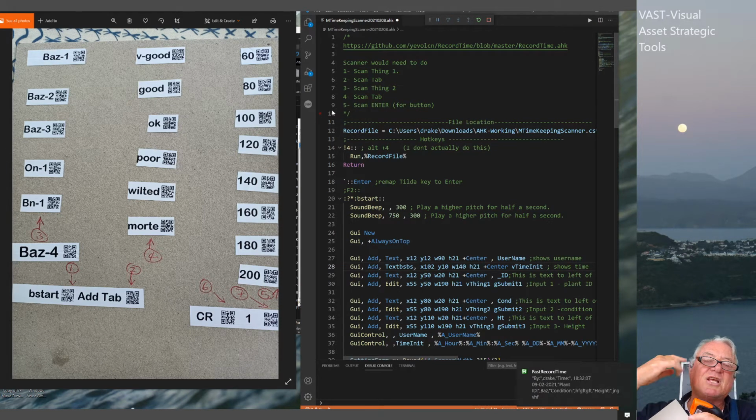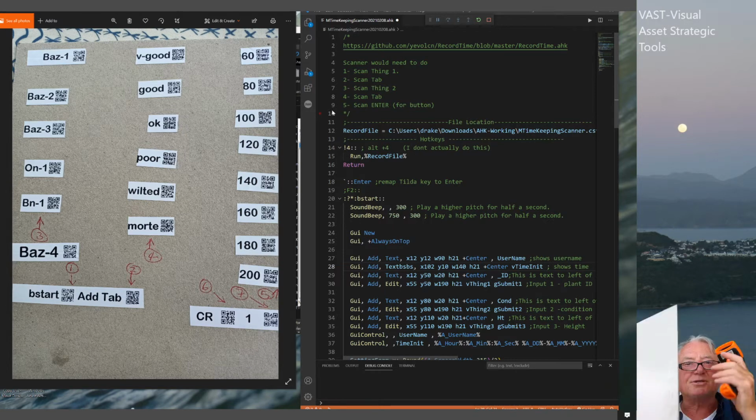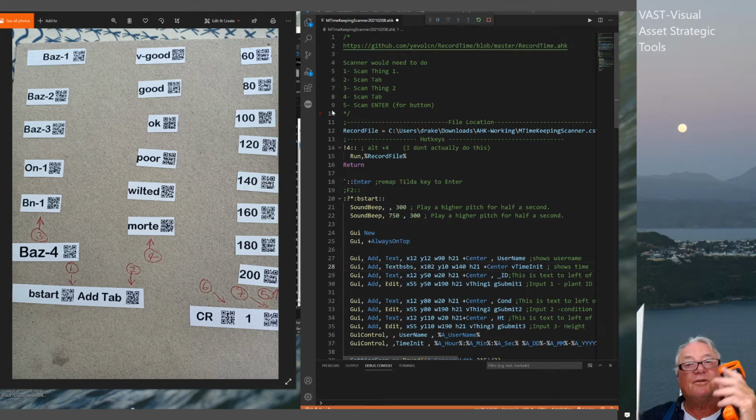I'm actually using indicators where I'm visually looking at the plants, scanning the information off the card that I've got here, is the process that I'm using for this as an exercise. So I'm not looking at the computer, but I want to know that what's scanned, I know I can feel the vibration such that it's gone to the scanner, but has it been sent to the PC? So am I putting good data into the computer, or am I just missing some of the data out? So at this point in time, that's what I was actually doing.